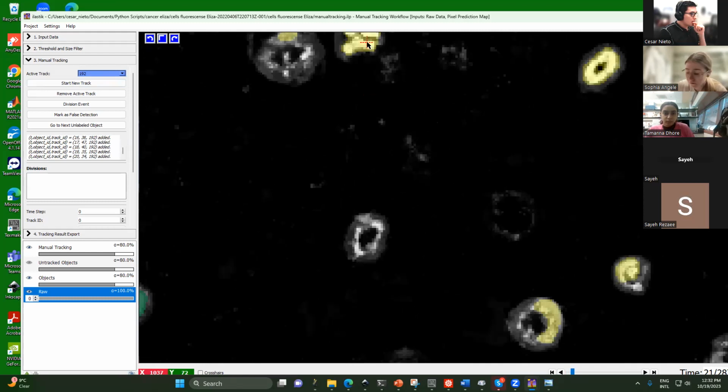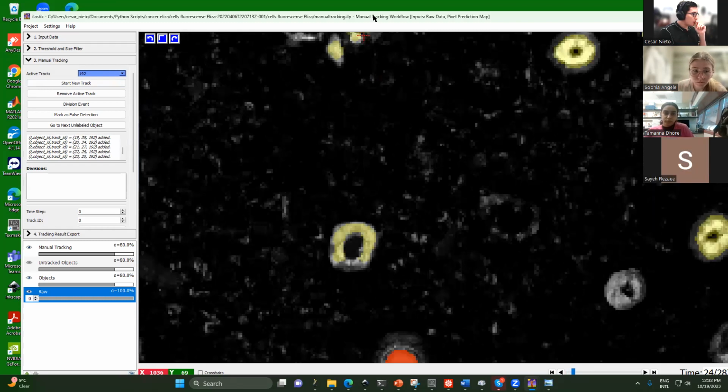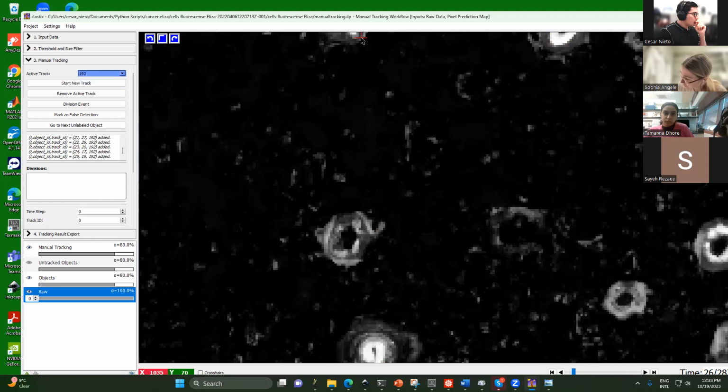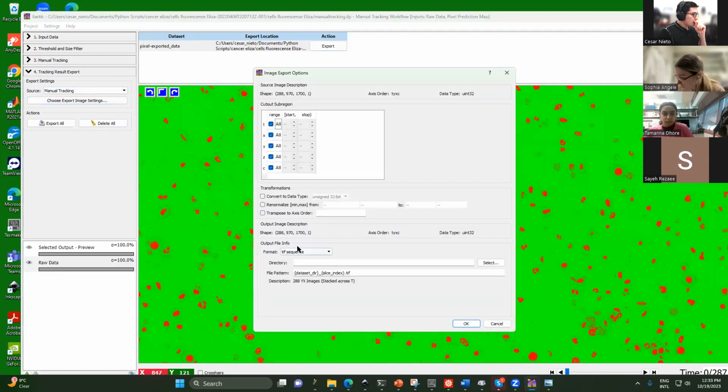Here, this one seems to abandon the frame. So it's not always good. And I export the data again. This has TIFF sequences. The other one was H5. Sorry for that confusion.